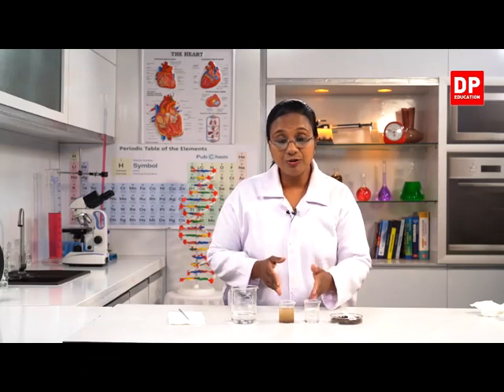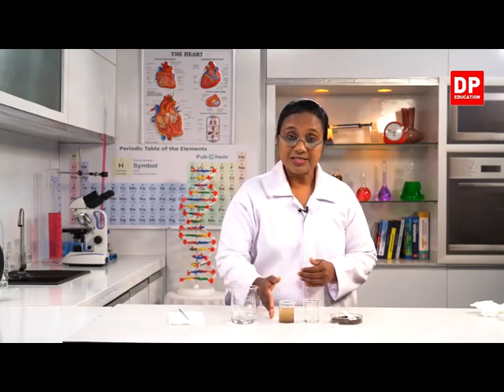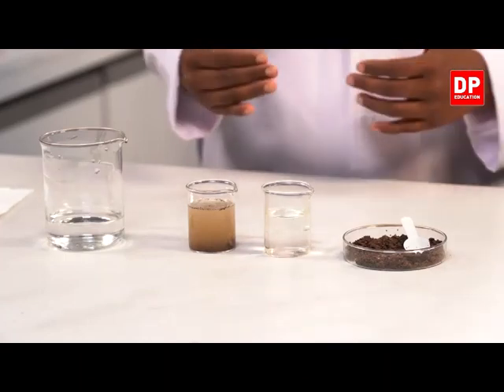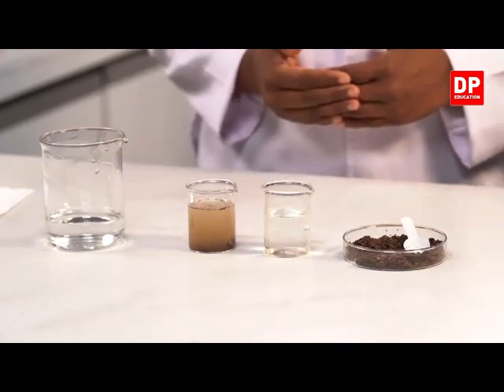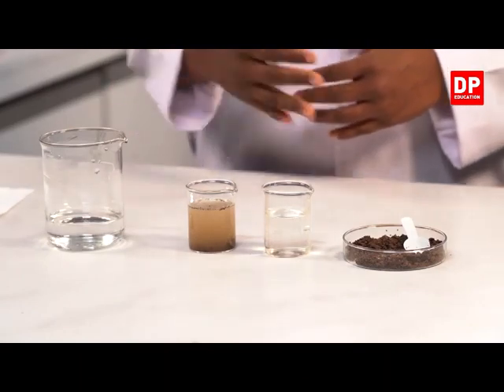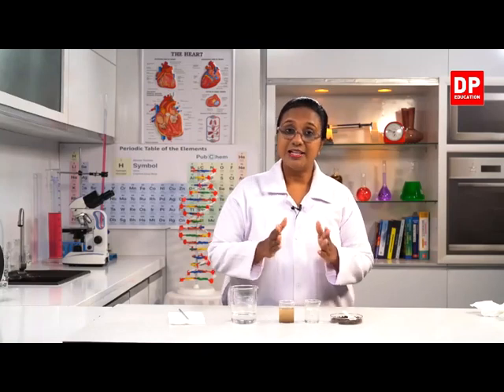The salt solution is a homogeneous mixture where the composition and the properties are uniform throughout the mixture. But the second one, the clay dissolved in water, is a heterogeneous mixture. Why? The composition is not uniform throughout the mixture, and you can also see the physical properties such as transparency and color are different throughout the mixture. So now I am sure you all can understand the difference between a homogeneous mixture and a heterogeneous mixture.